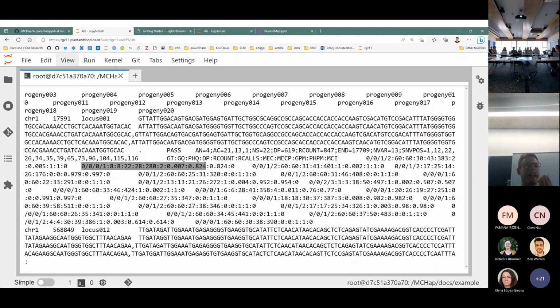And so it is a different probability, but it's now a probability that's conditioned on the assumption that all of the haplotypes we put into this program are the only haplotypes present in the population. So as long as your prior is realistic, then it is a realistic improvement in the posterior probability. If you start having problems with your prior, then that's when you get weird results out the end that don't make sense, but will make themselves look more confident than they should be.